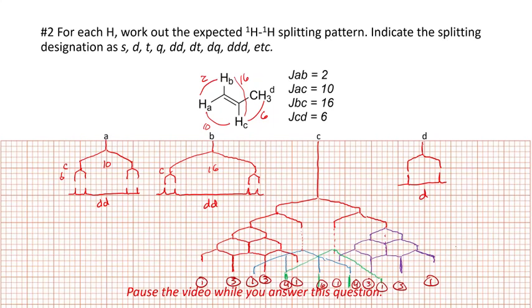Officially, this is called a doublet of doublets of quartets. However, we would probably call it a multiplet and just leave it as a whole bunch of lines rather than actually ever work that out. All right, enough of that.